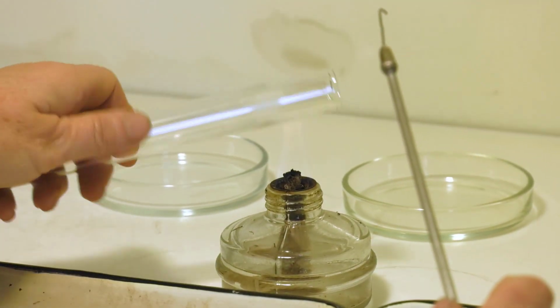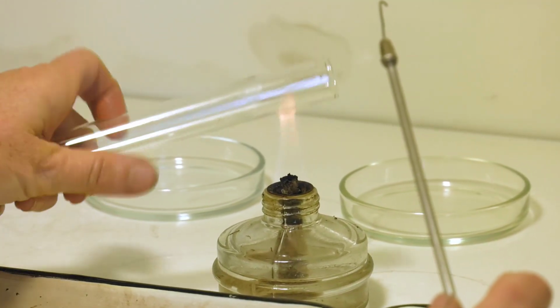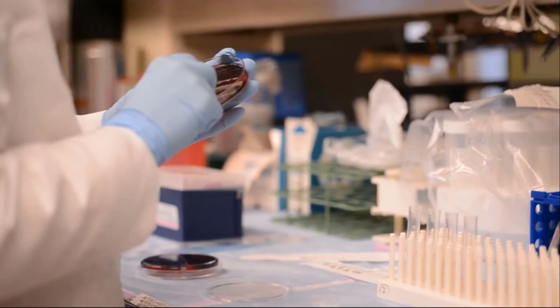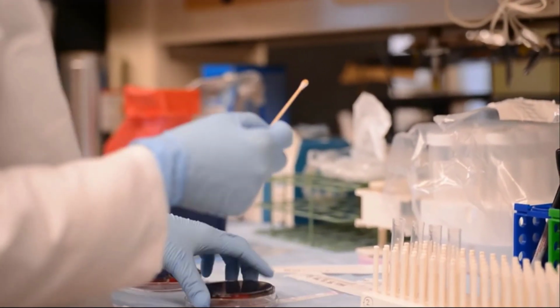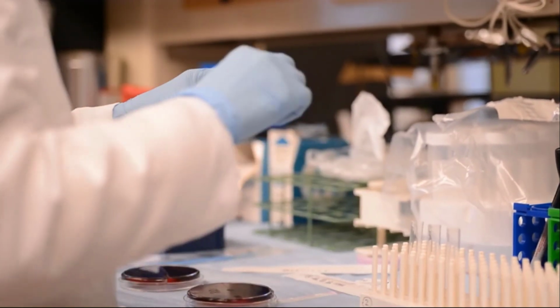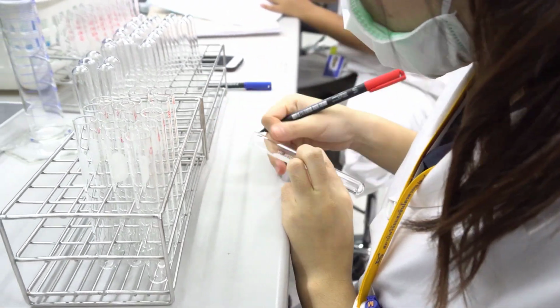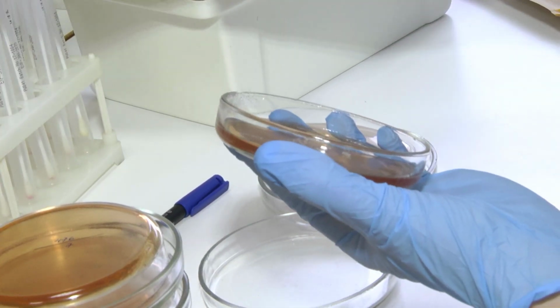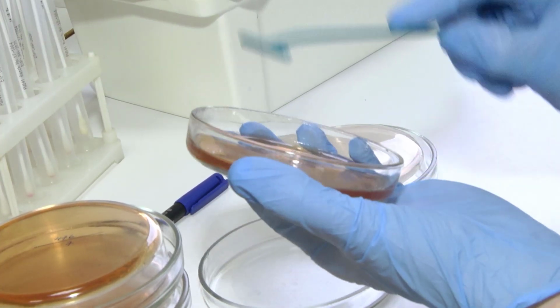Each student should quickly learn and continuously practice aseptic laboratory technique. It is important to prevent contamination of your hands, hair, and clothing with culture material, and to protect your neighbors from such contamination. In addition, you must not contaminate your work with microorganisms from the environment.